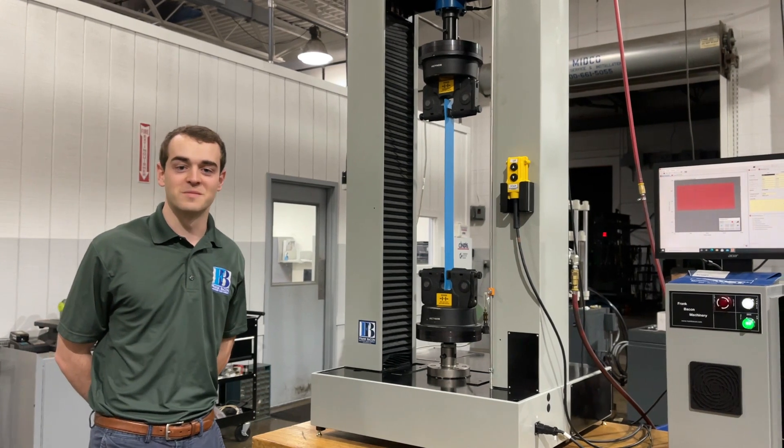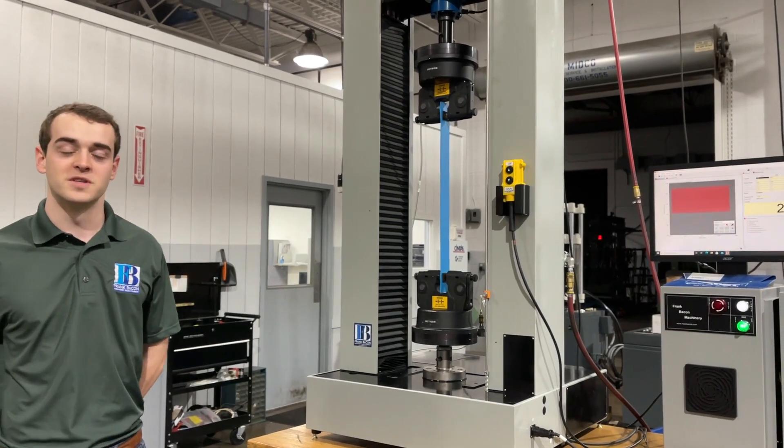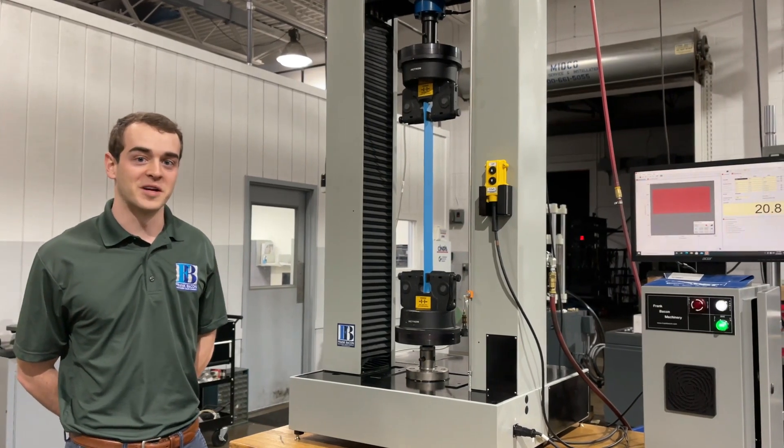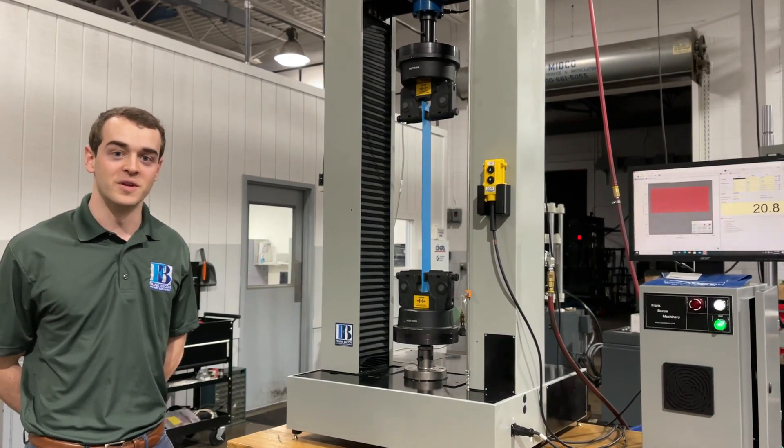Hey everyone, Chuck here with Frank Bacon Machinery, here to show you a nice machine we just finished up and tell you a little bit about the Frank Bacon difference with this specific unit.